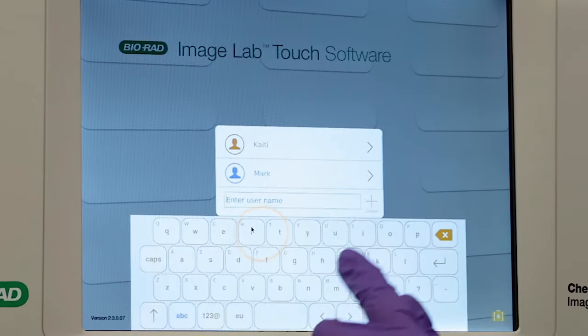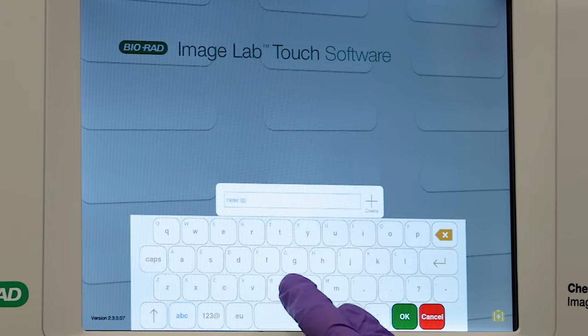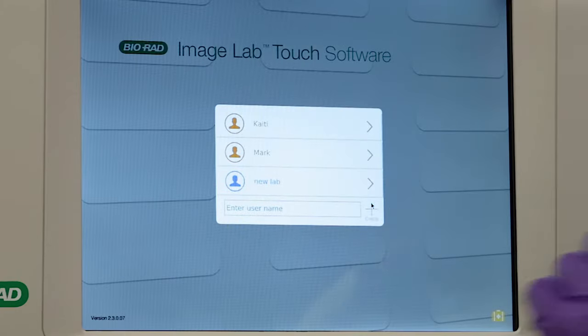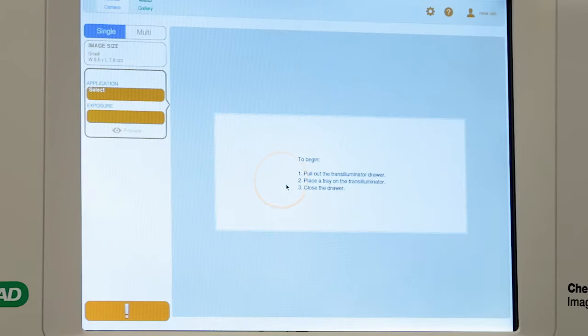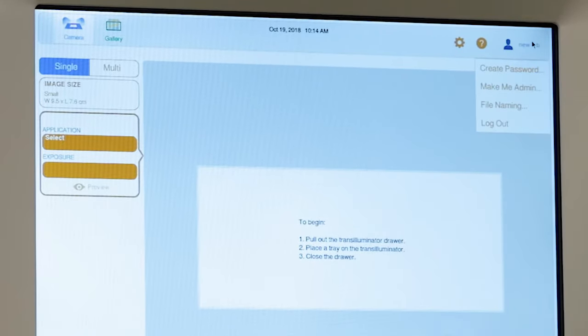If you're a new user, type the desired username, click the plus sign, and the new login will be entered. Administrative controls can be set by clicking the person icon in the top right-hand corner.